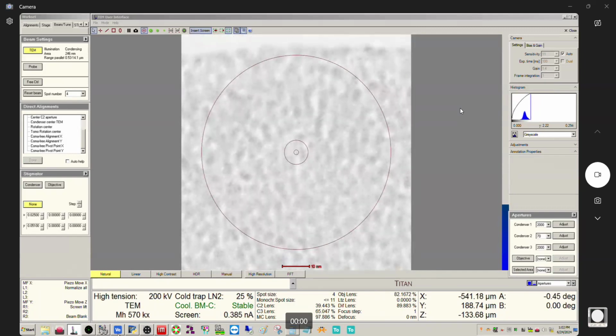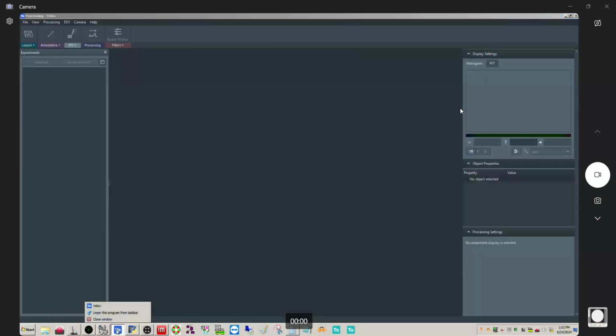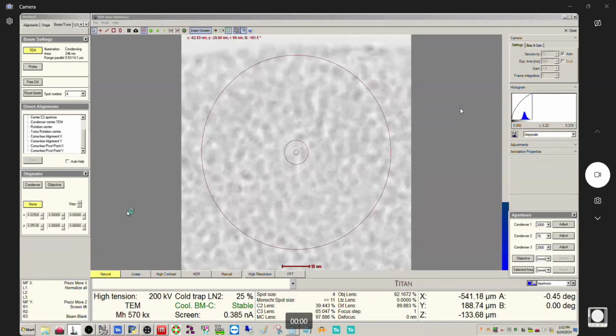Okay, so from here, I'm going to pull up the acquisition window. Oh, what happened to it? All right, let me restart.